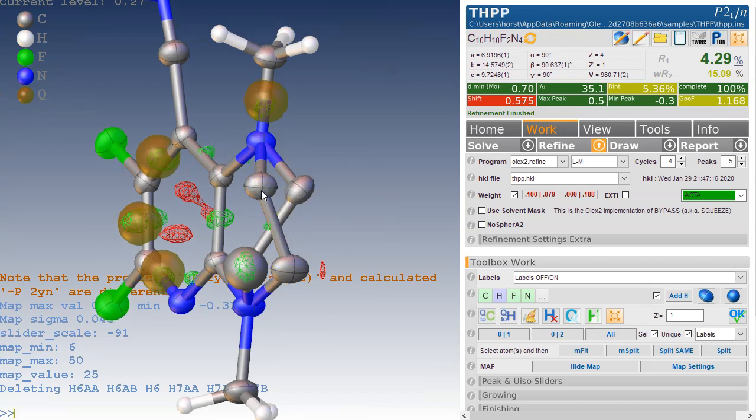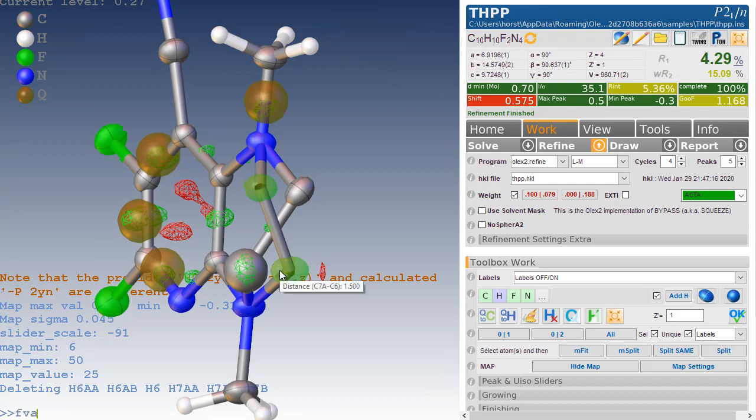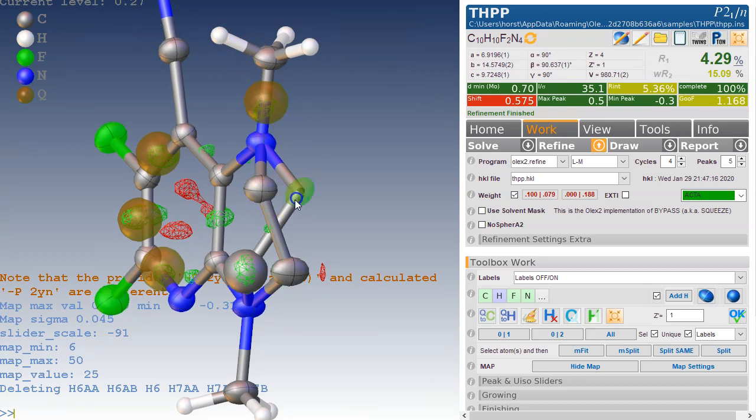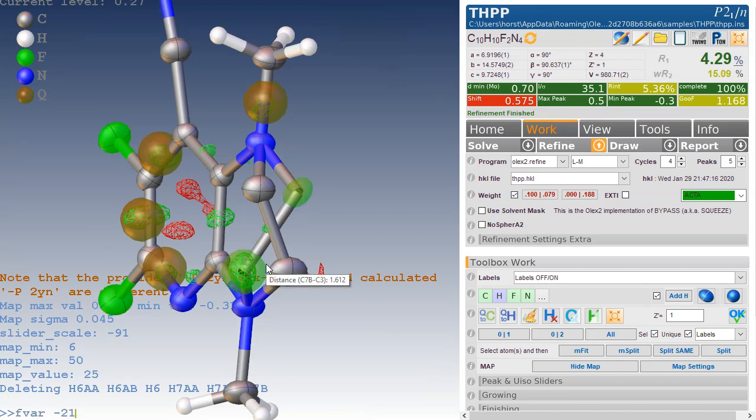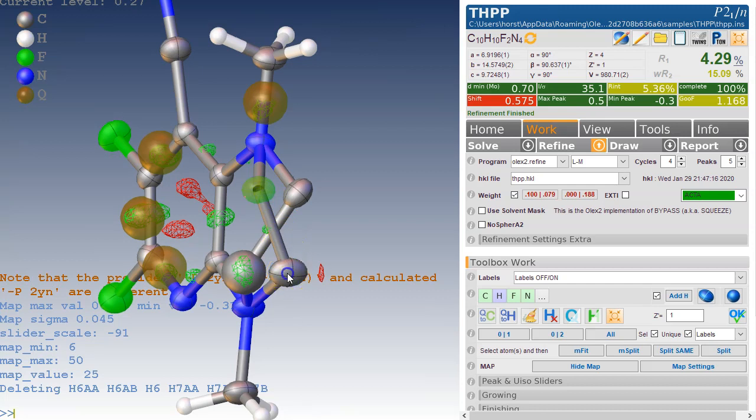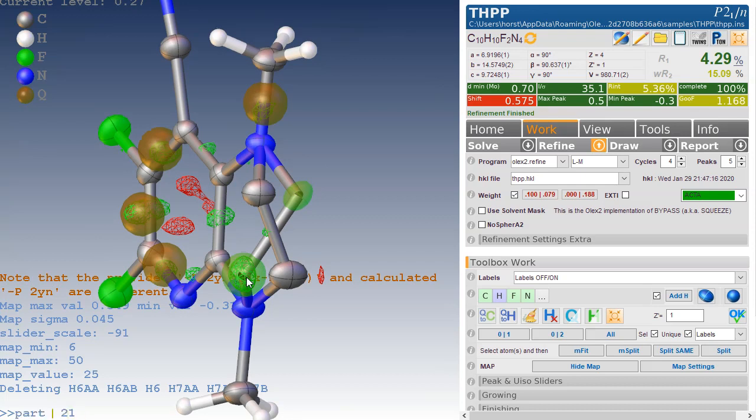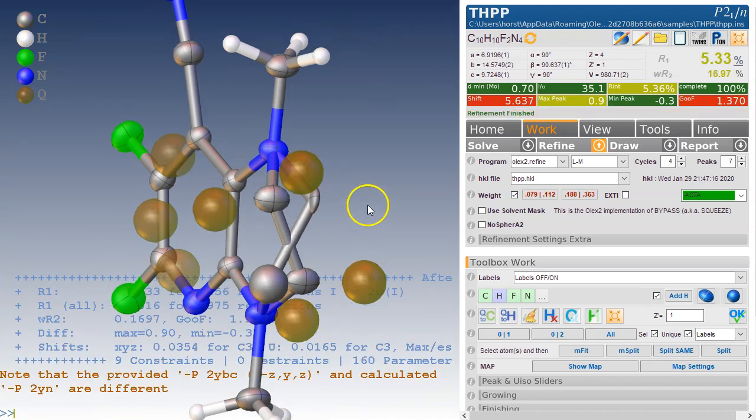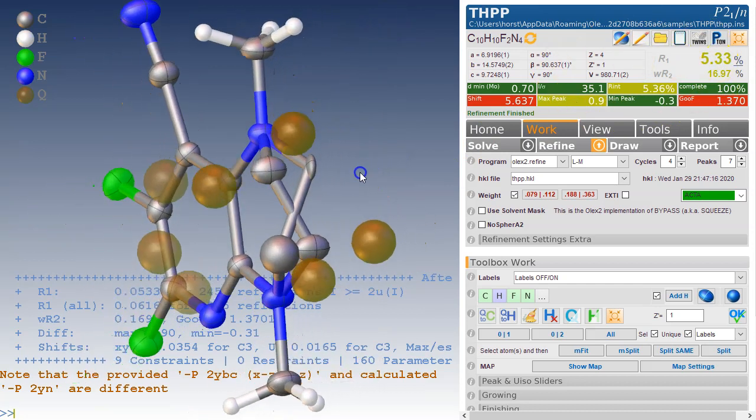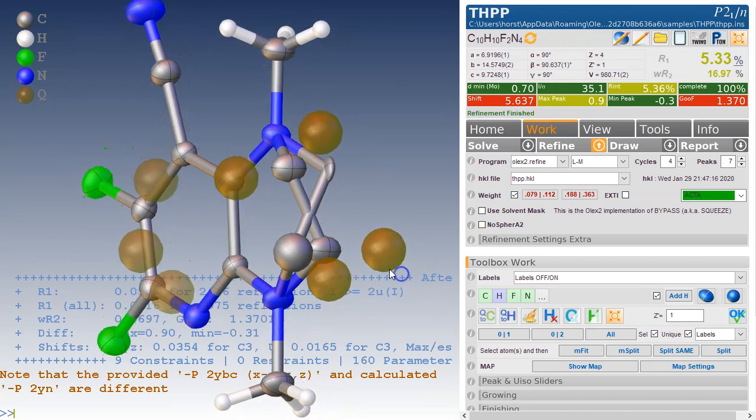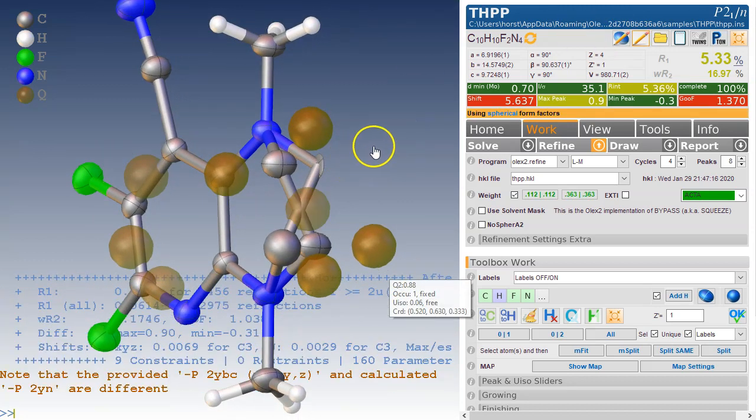So what we need to do in order to honor that is click on both of those and this would be f var 21. So we're choosing the free variable 2 and it's the first part, and this one would be f var minus 21, which means it's coupled to the first, the same free variable, but it's 1 minus that value. We could have also done this differently. We could have taken this and type part 1 21, which is just a shortcut of saying the same thing, and of course this one the same, up key, part 2 and minus 21. Now if you refine this we will see what happens. Well it actually refines stably. The R factor is not good but we're also missing the hydrogens and we can see the hydrogens are coming up here.